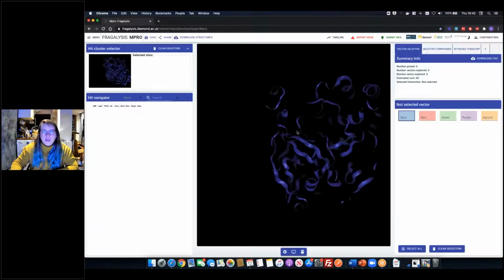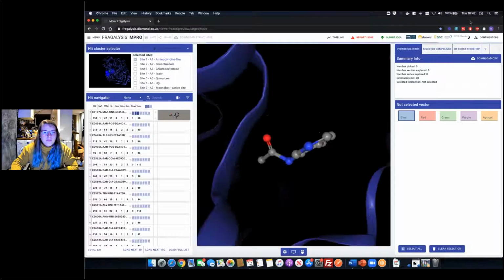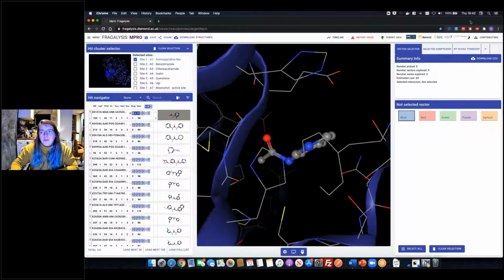So if we navigate to one of those target pages. I've just put the link in the chat, so I don't know if you want to just pause for a few seconds to let people click on it if they want to follow along. Yeah, absolutely. I'll just give you a second to get there.